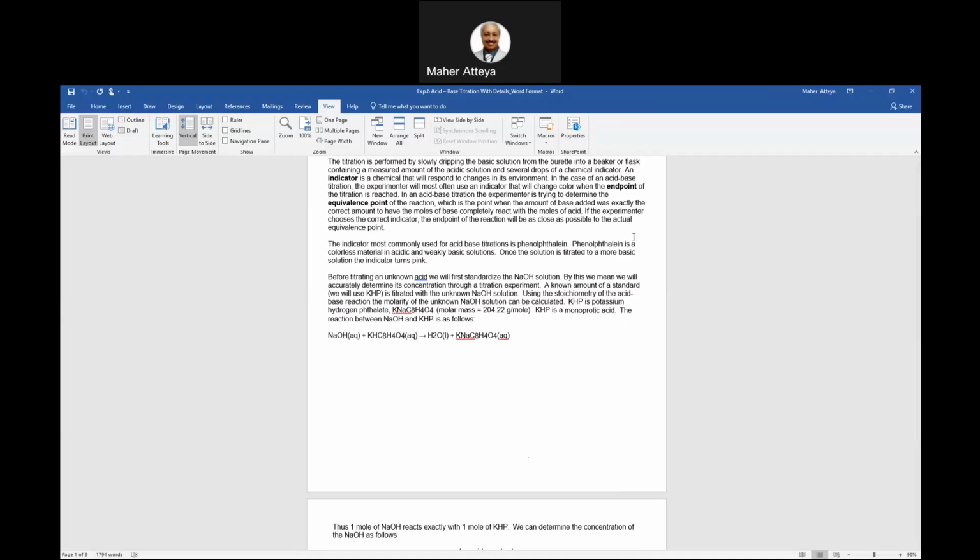I'll mention this one when I conclude the presentation. I'll show you how to do the calibration, the titration itself. So titration means standardization, a double displacement reaction, correct? And it means neutralization. All those terms mean the same thing: an acid is standardized with a base.